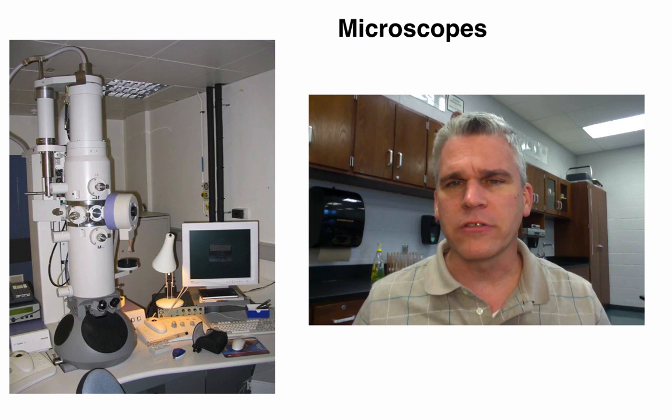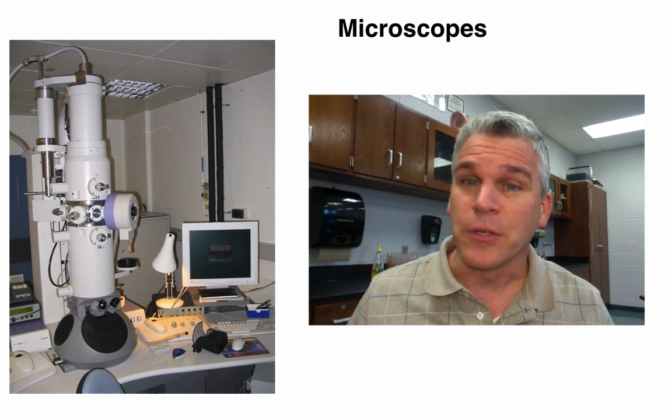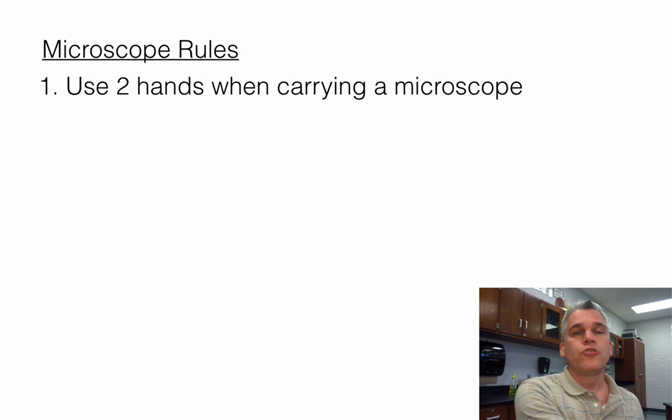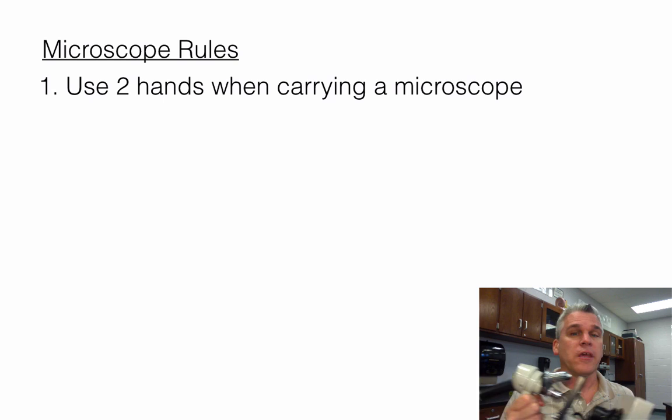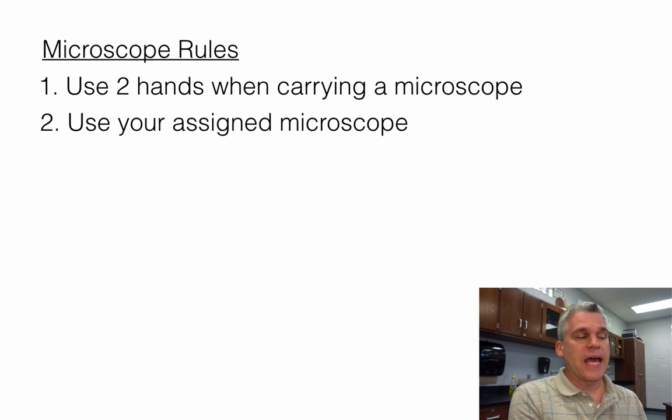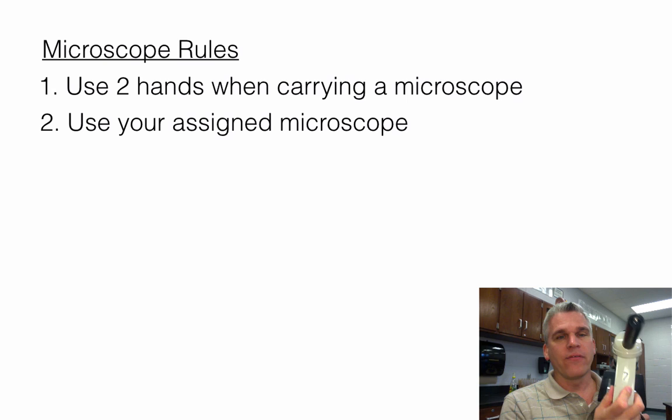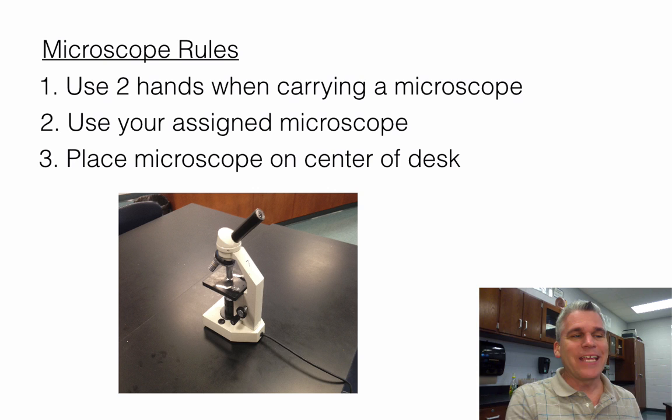So let's go over some of the rules. Always use two hands when carrying the microscope — one on the arm and the other on the base. These are expensive pieces of equipment; we don't want to be swinging them around with just one hand. Use your assigned microscope — all microscopes are given a number and that's the one you'll always use. Place your microscope on the center of the desk to prevent it from falling if you accidentally trip on the cord.